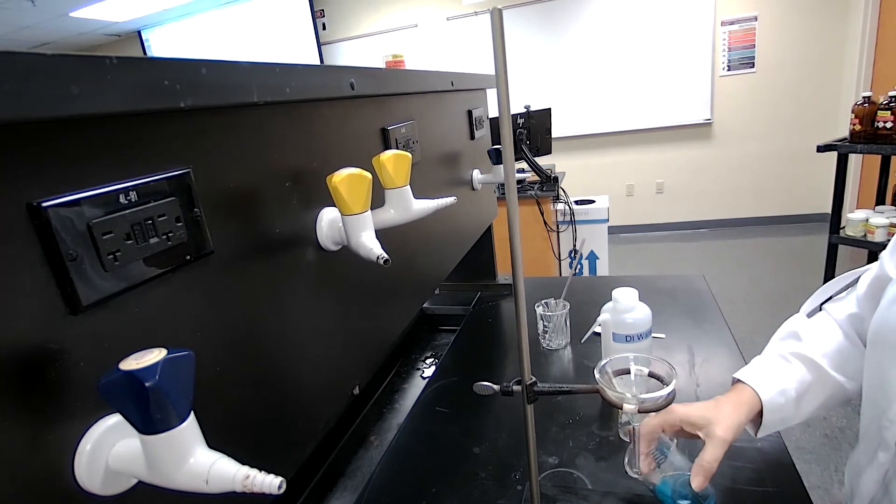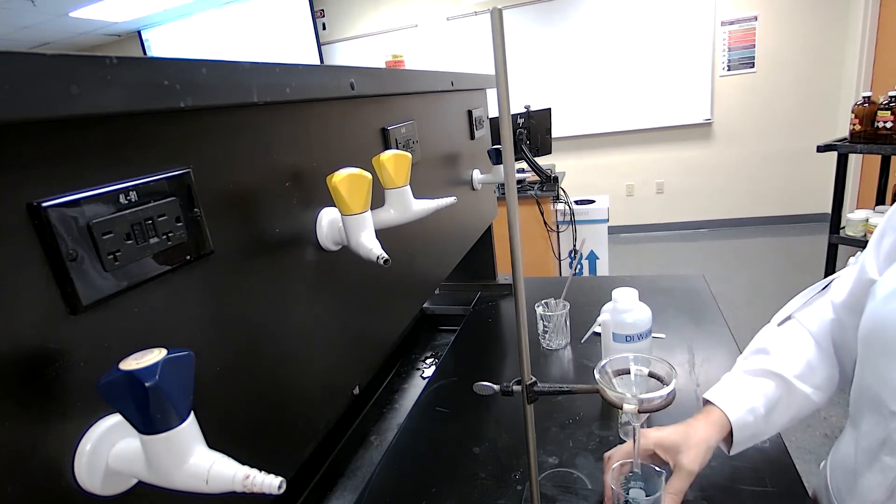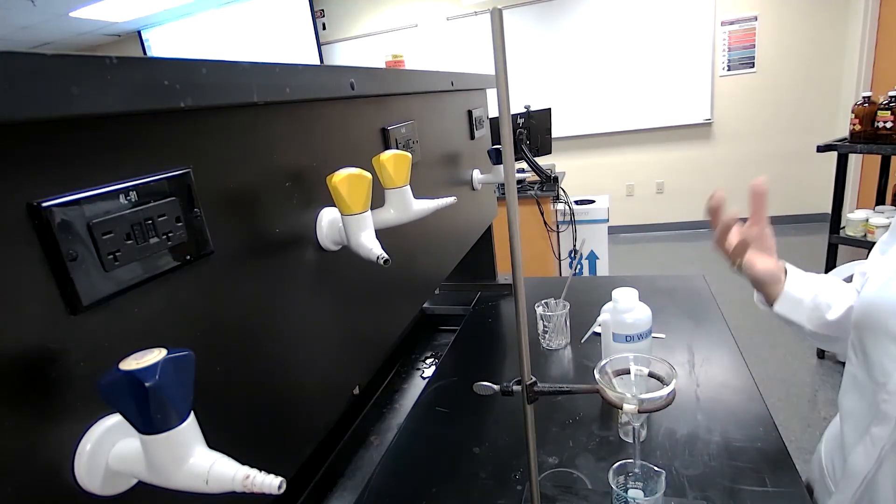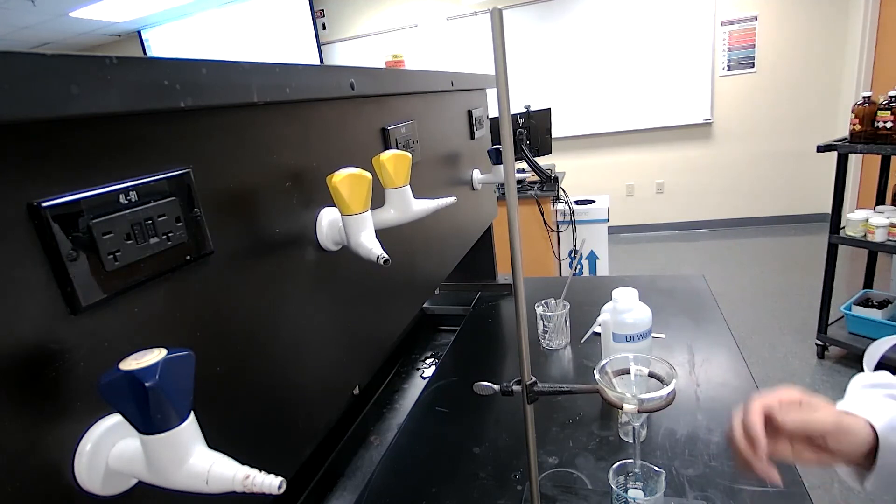For this liquid, it can be evaporated and then you end up with copper sulfate because that's the separation technique or physical means for separation.